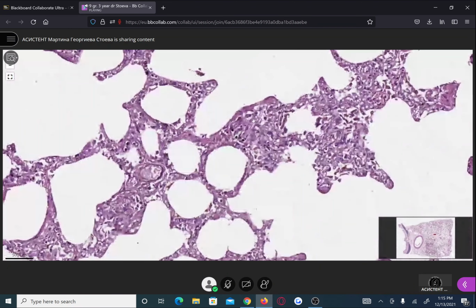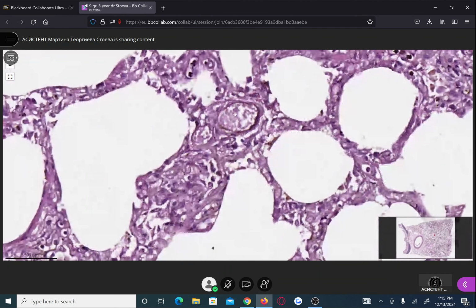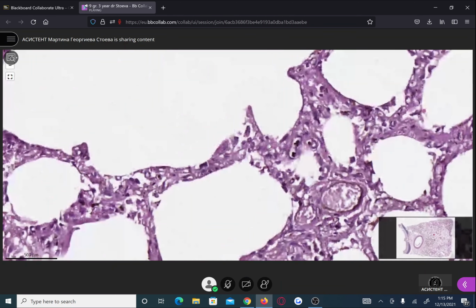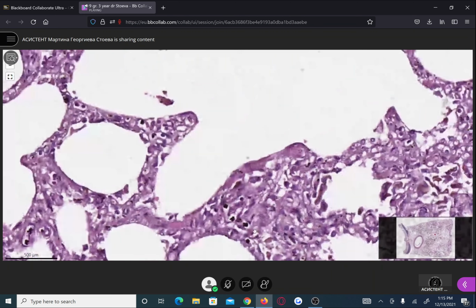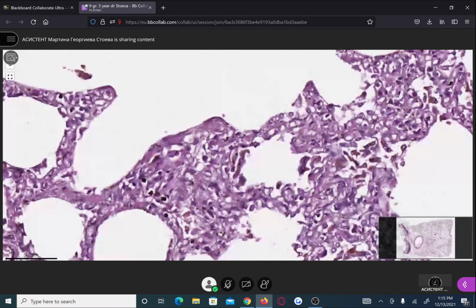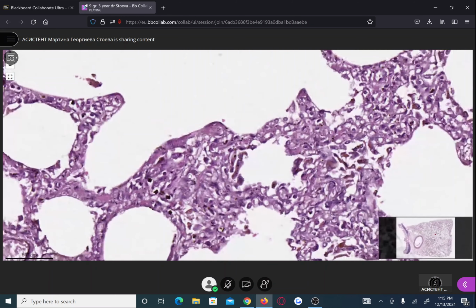This is because of the congestion, due to the fact that here histologically we can see dilated blood vessels from the microcirculation, venules and capillaries. They are dilated and filled with erythrocytes. This is the morphology of congestion. Also, there is growth of connective tissue in the interstitium, which is due to the hypoxia caused by the chronic left-sided heart failure.